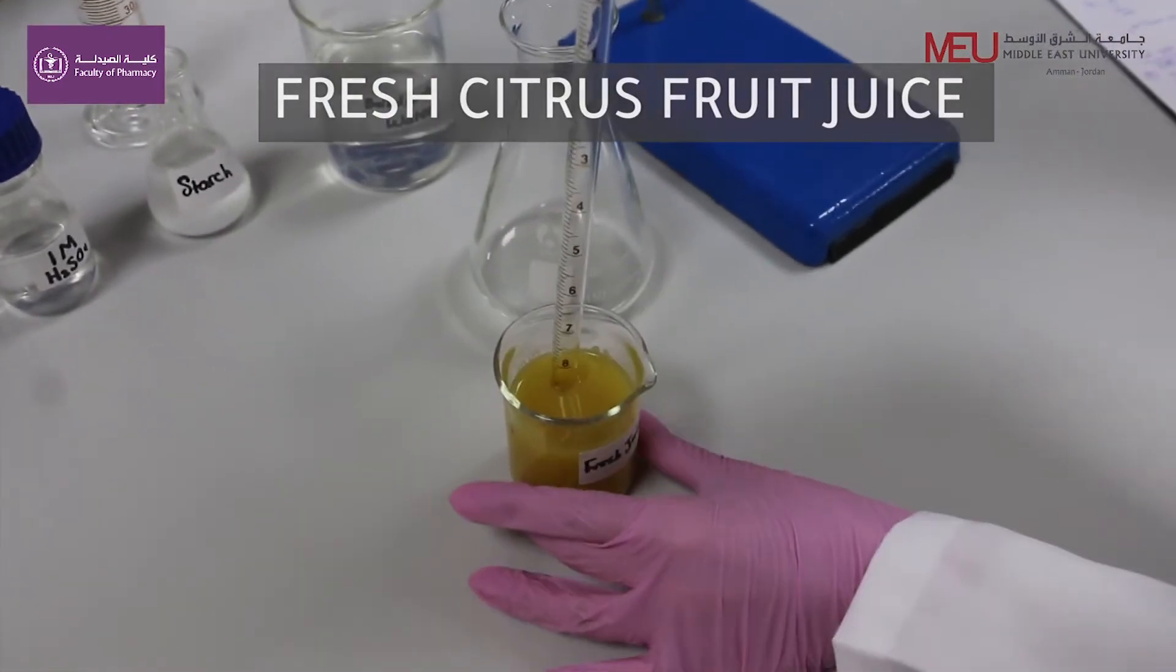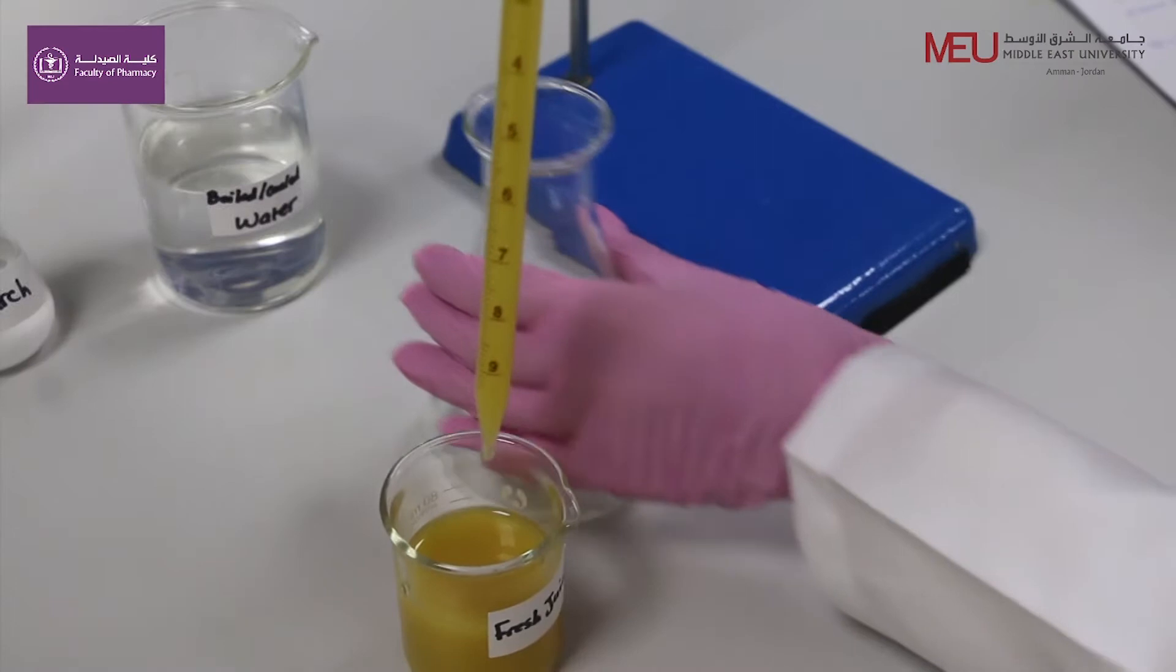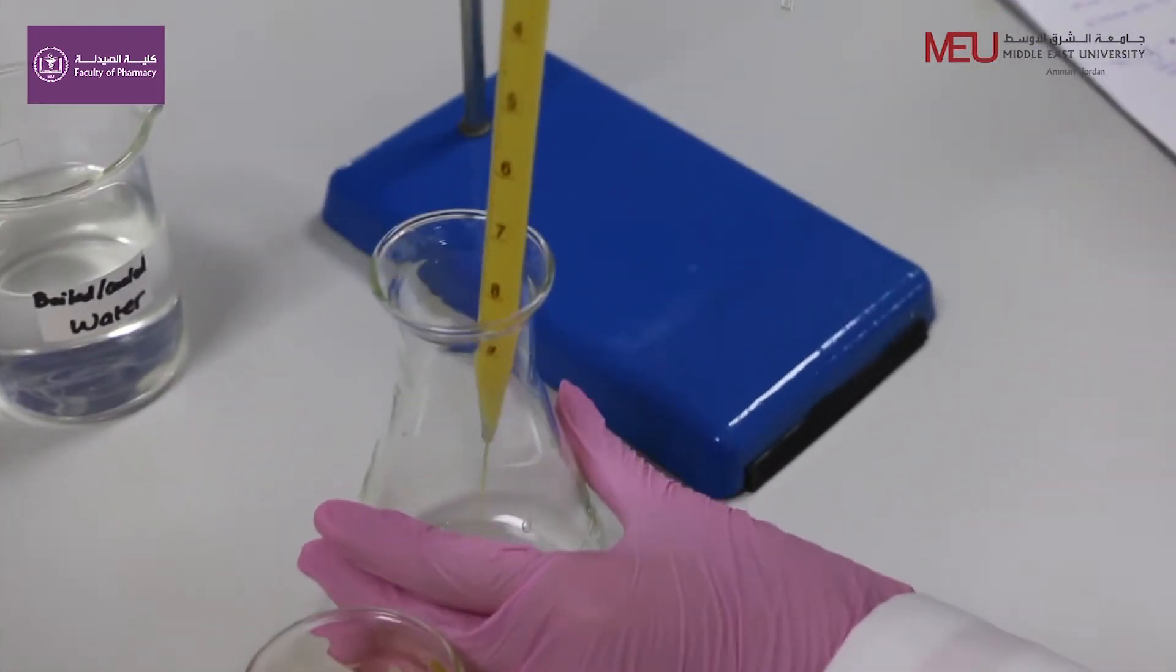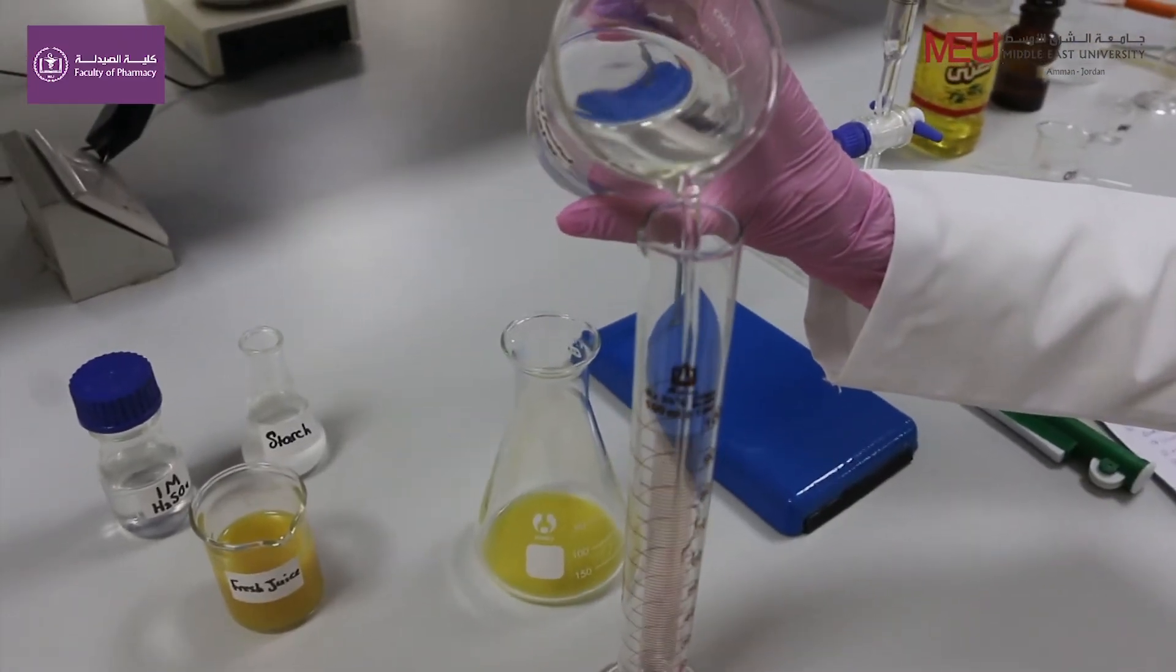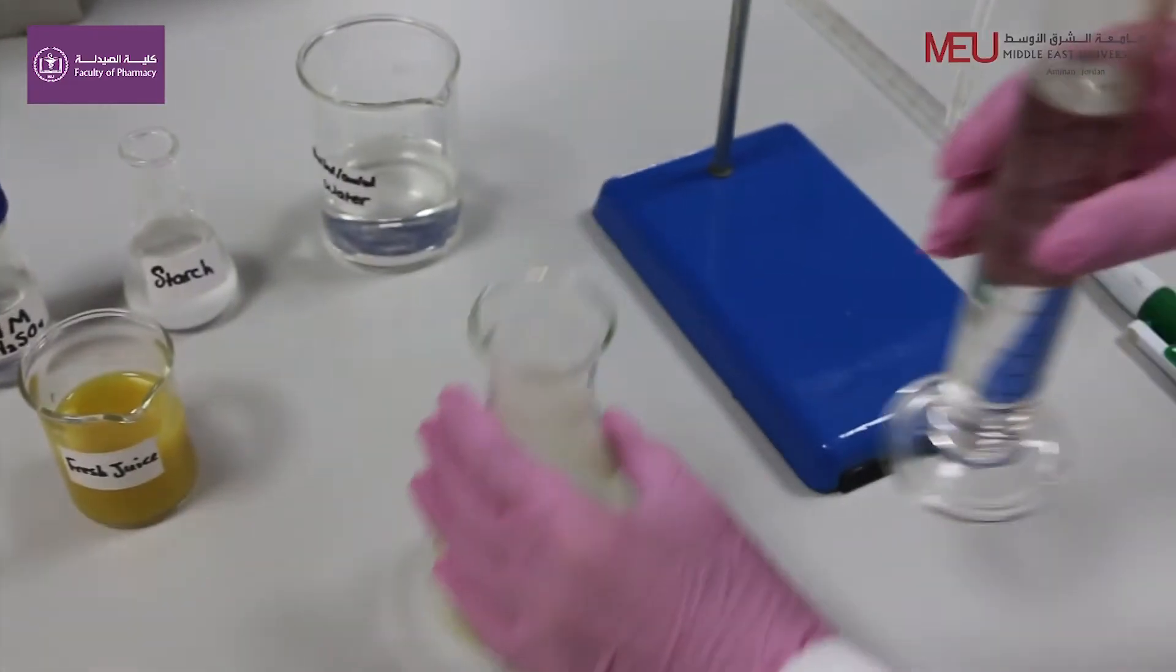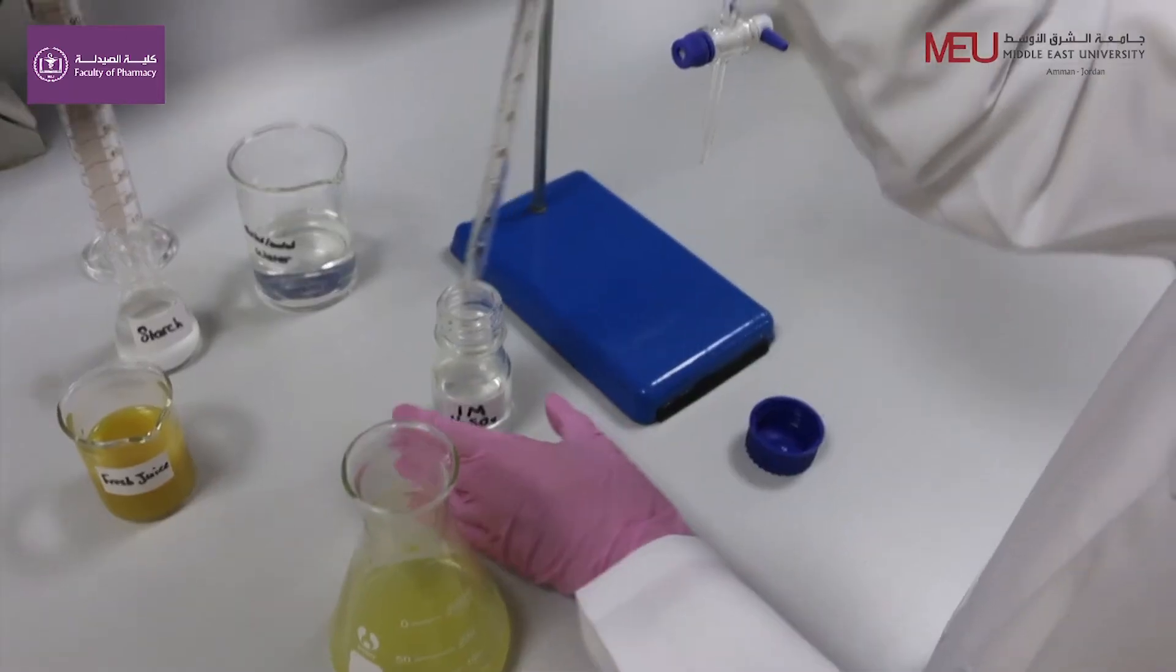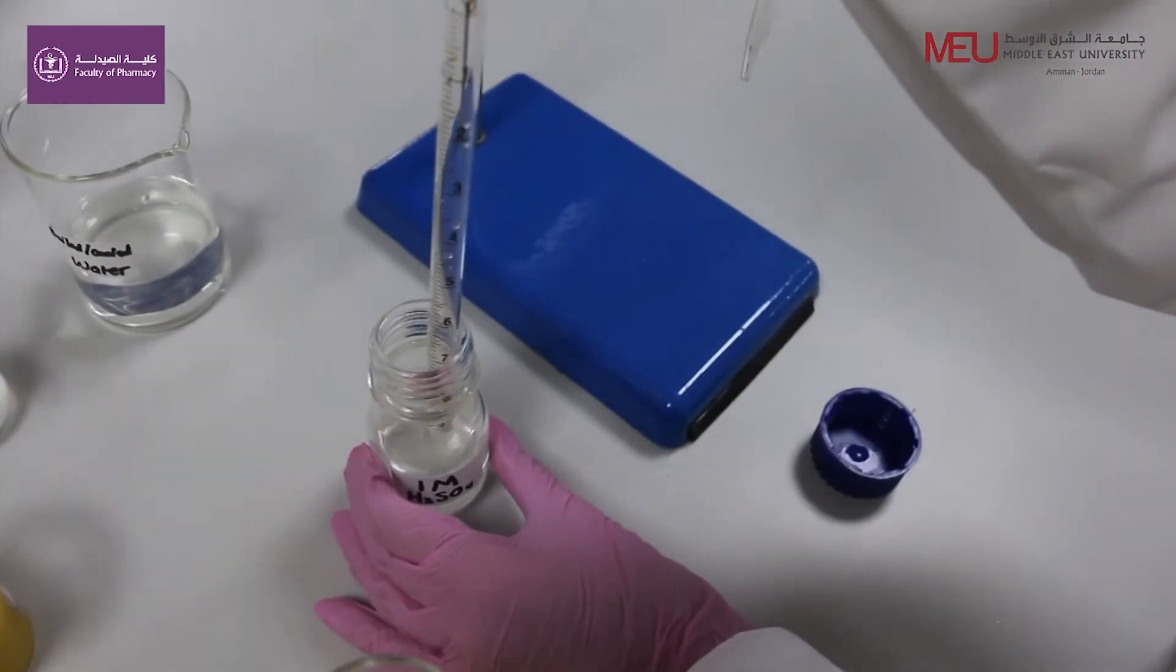Take 10 ml of the fresh juice. Add 80 ml of freshly boiled and cooled water. Add 10 ml of 1 molar H2SO4.